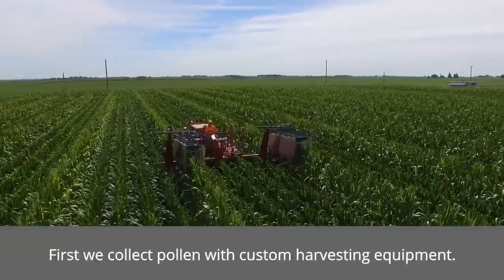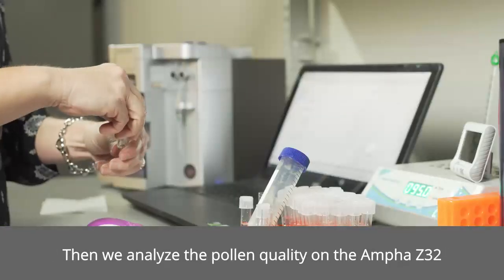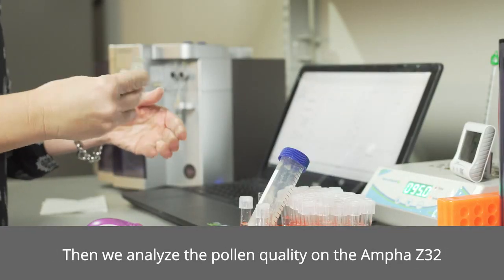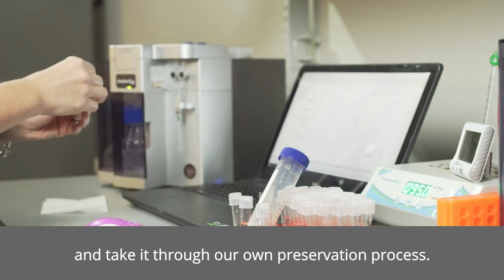So how does it work? First, we collect pollen with custom-designed harvesting equipment. Then we analyze the pollen quality on the Ampha Z32 and take the pollen through our own preservation process.